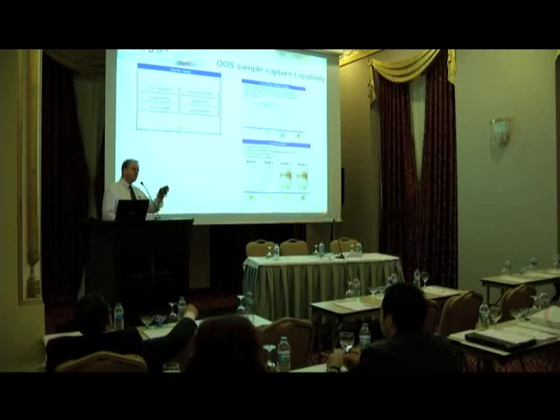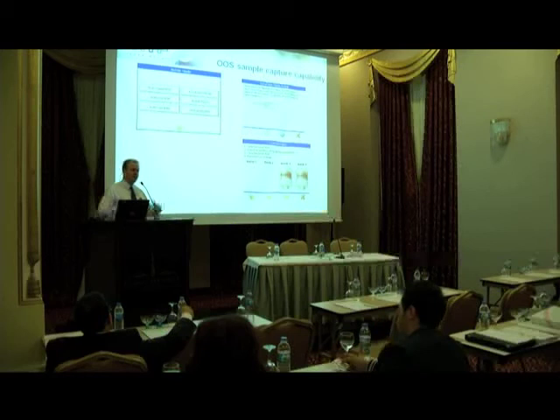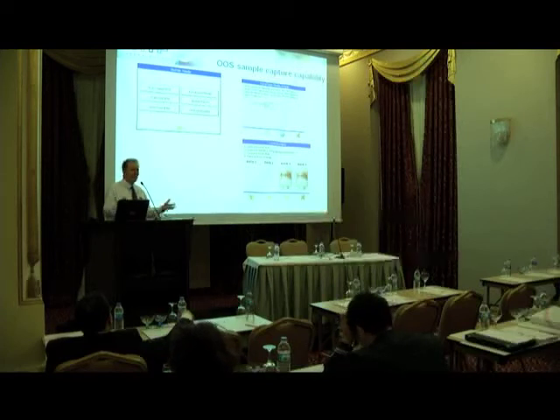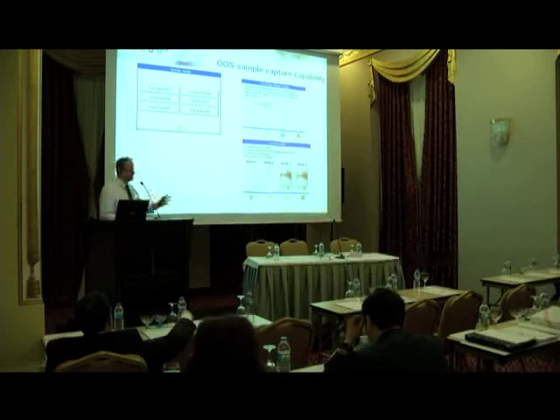Now this means you can take that bottle back to your QC lab and do a bit more analysis on that water to try and find out where that excursion came from in your water system. Because the last thing you want to be doing is putting contaminated water into your expensive pharmaceutical product. Because then you've ruined your product and it's very expensive. So this helps us to do a bit more root cause analysis.